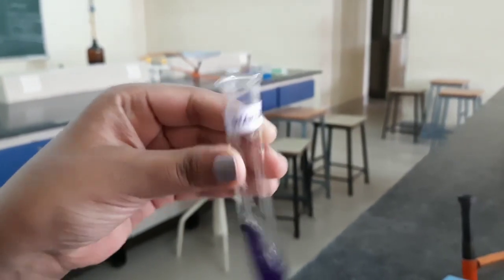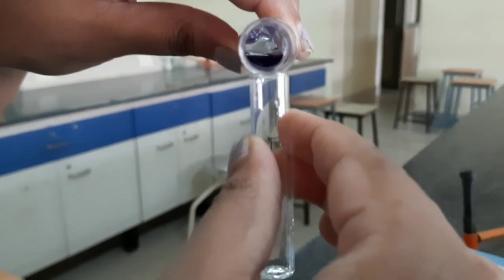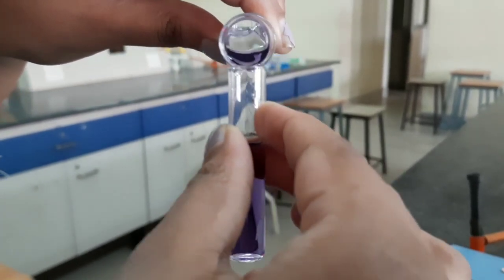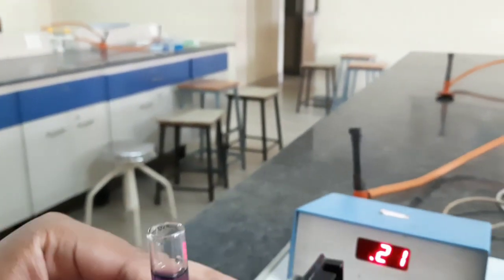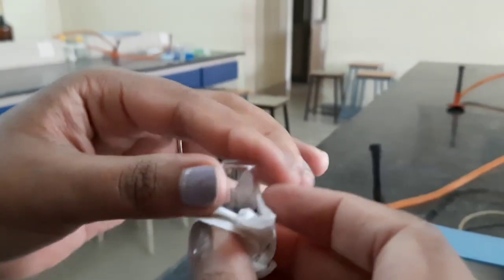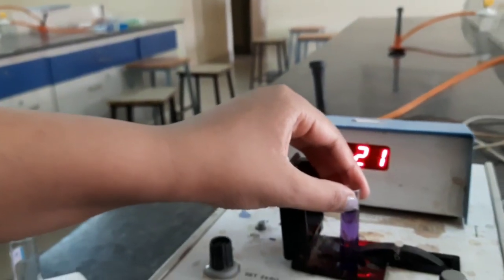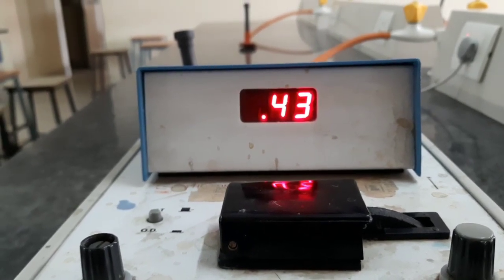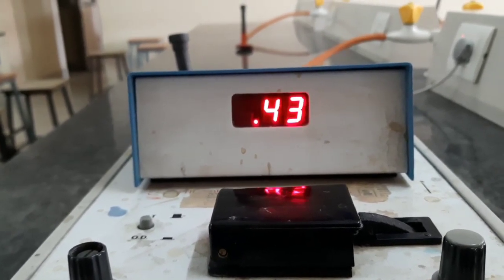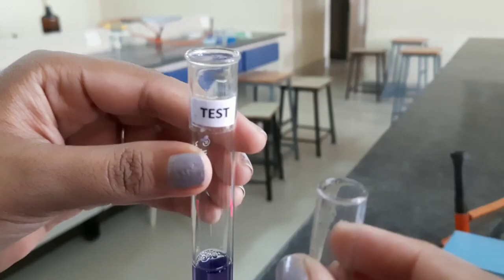Now we are going to check the OD value for the standard. We are going to transfer the standard into the cuvette and measure the OD. Now you can see that the standard OD value is 0.43.